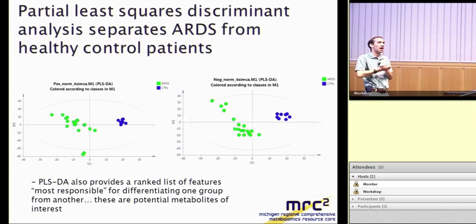We operated under, for the limited purine metabolism pathway, the assumption that whether they're host or bacterially derived, and you're right, we don't have the answer for that, they're closely associated with one another. The KEGG pathways that are used are reference pathways and are closely linked whether you're in bacteria or in a mammal. It helps visualize connections between the metabolites, but to absolutely say that this goes to this, and quantitatively so, is not a fair means of looking at things.